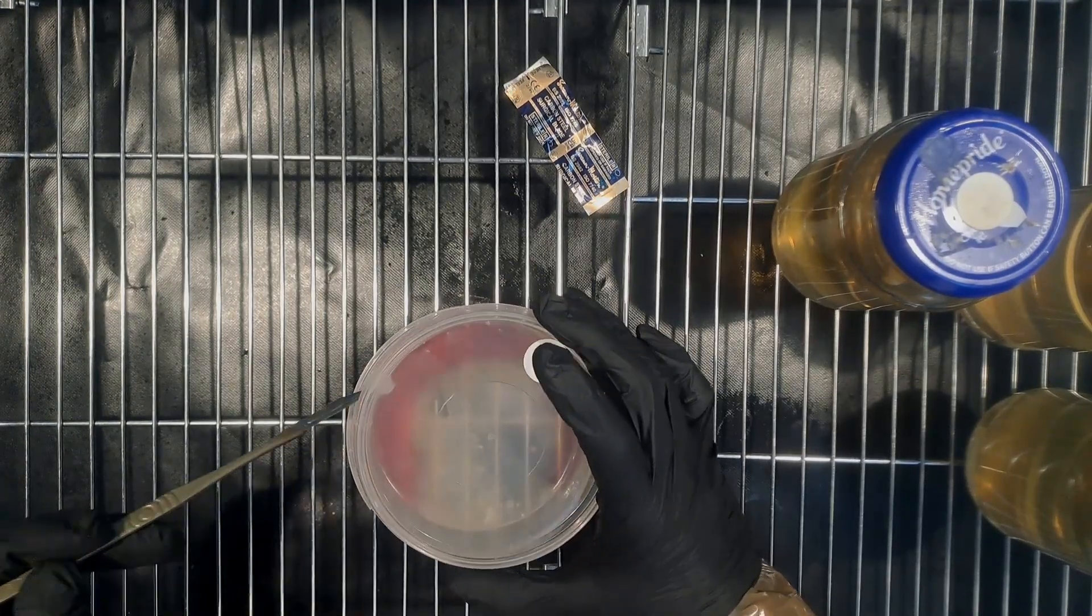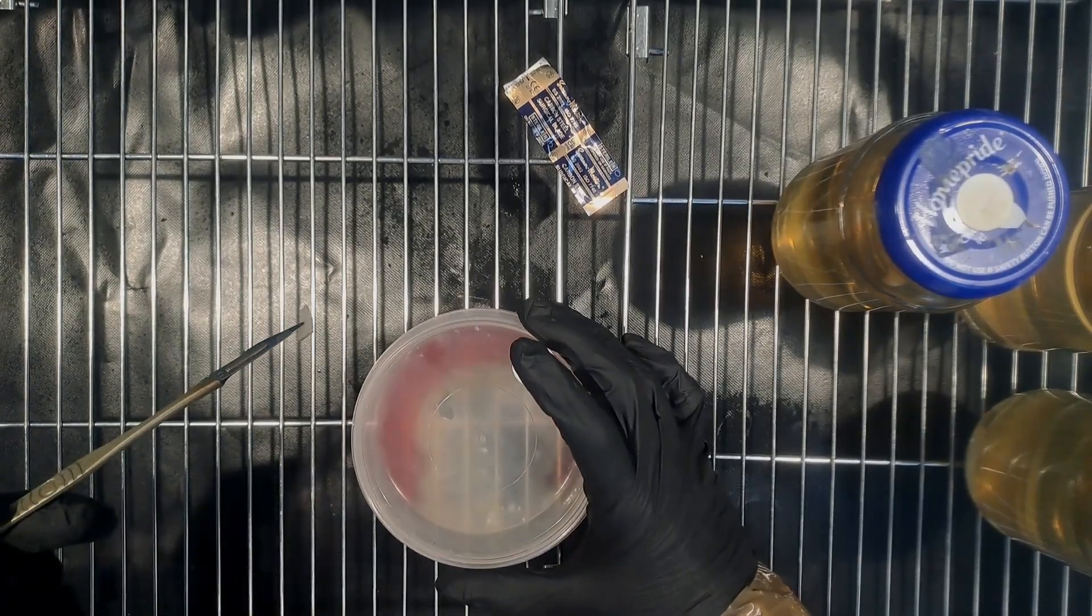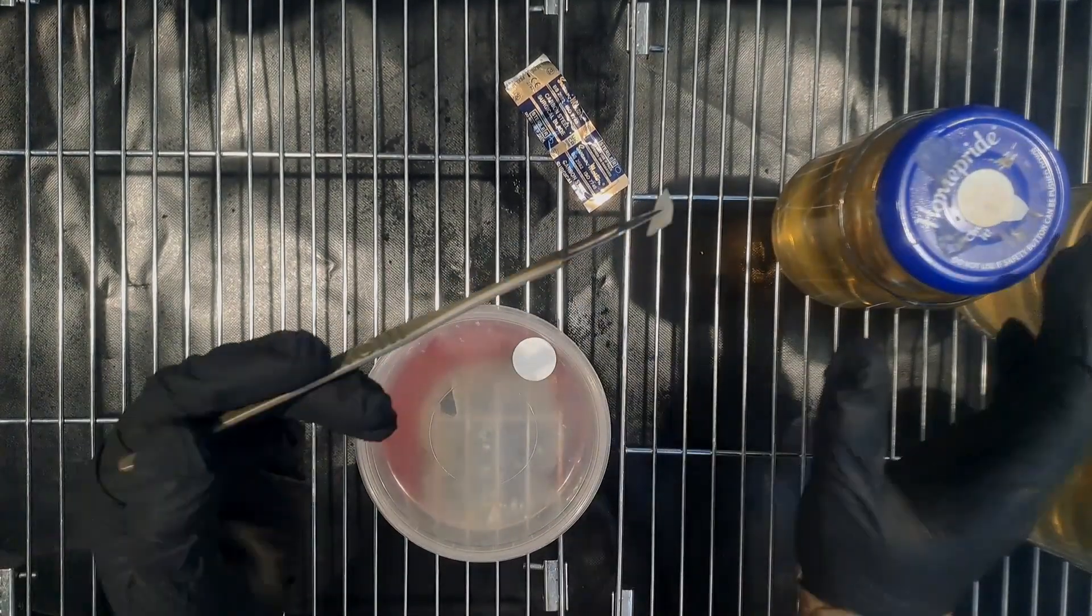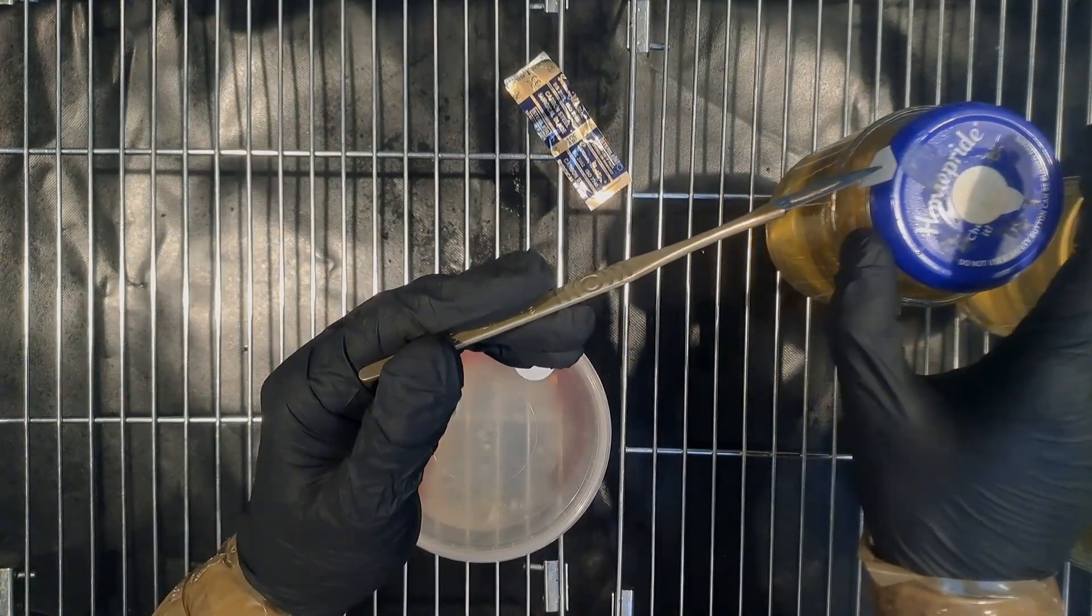I'm going to cover why I'm cutting in different areas at the end of the video. Just cut away a small amount of agar and then just knock it off into the liquid culture jar.